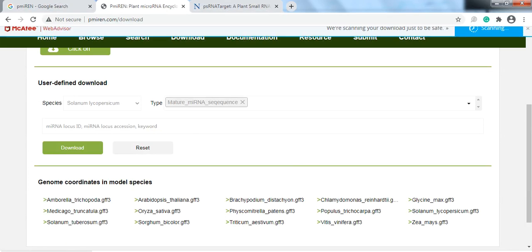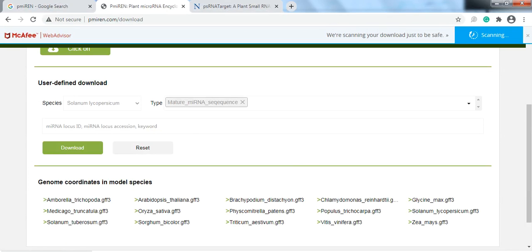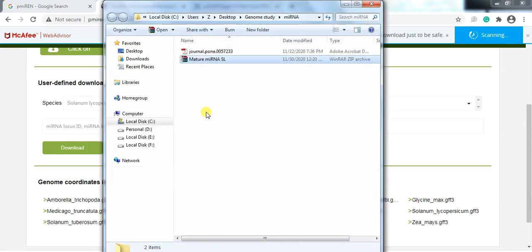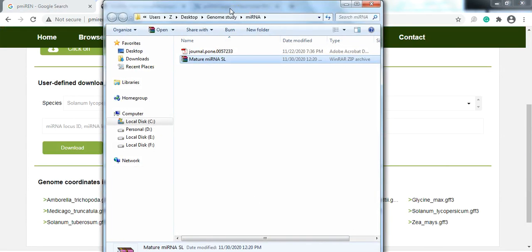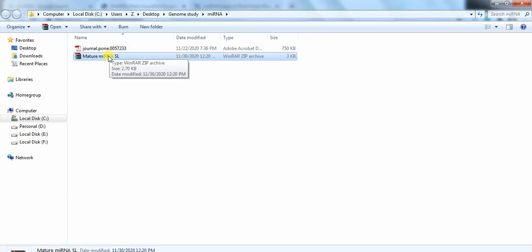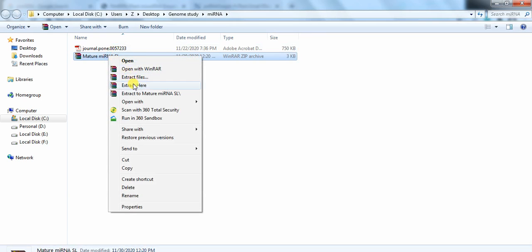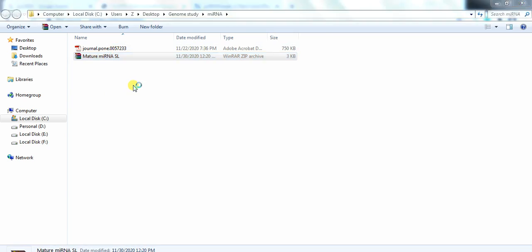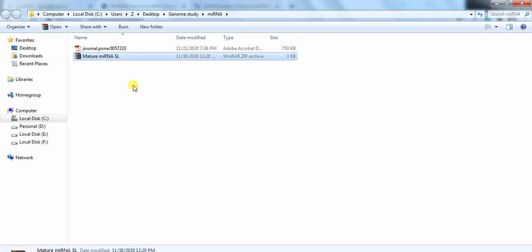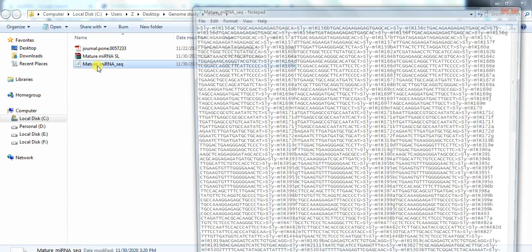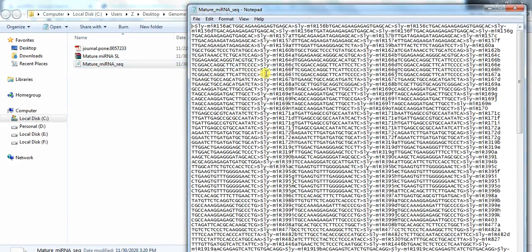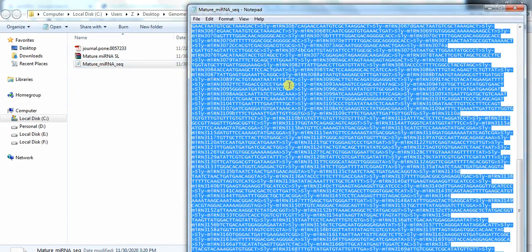Open the folder, extract all the contents, then select all and copy.